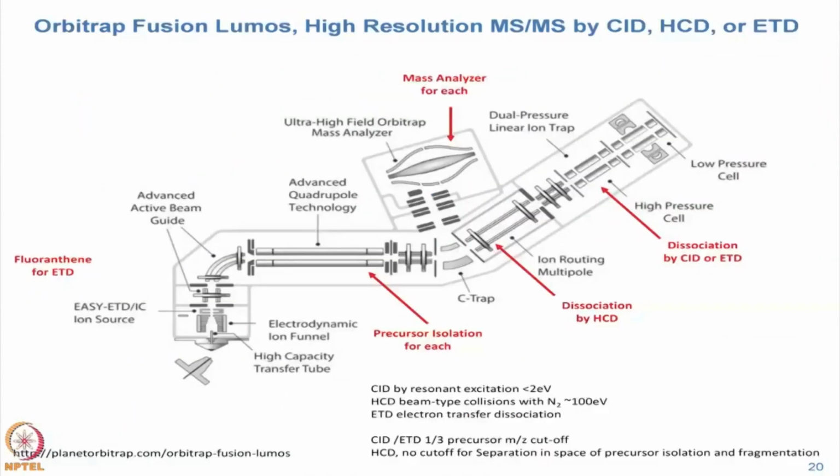This is one of the, I want to say most desirable instruments, but it's most desirable only if you can afford it. It's one of the most expensive instruments, and it can do a whole lot of things. The CPTAC program is currently generating almost all of its data on this kind of an instrument, but we don't use the entire capability of the instrument.